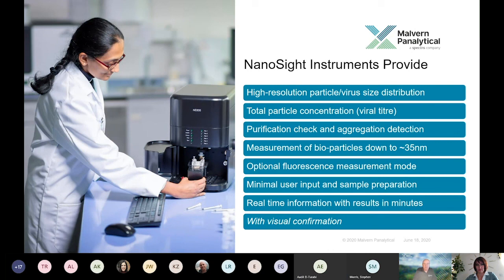And just very briefly, why does DLS tend to give broad distributions? The correlation function, which I mentioned at the start, ultimately is what we obtain in a measurement, and we have to analyze that correlation function to get our size distribution information out of it. Let's imagine a sample which consists of only one size. Nobody on planet Earth can do that.